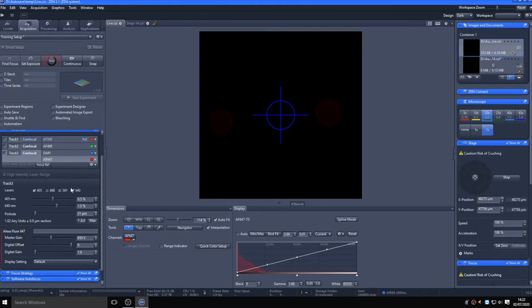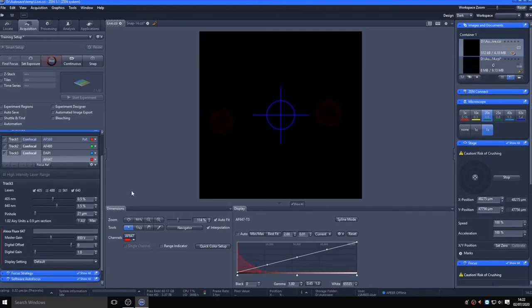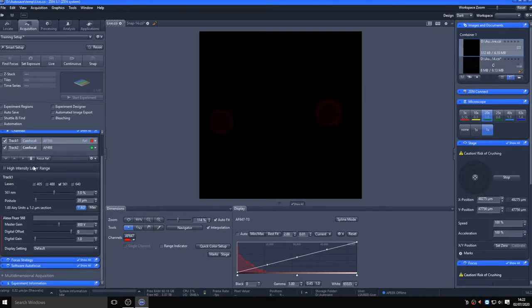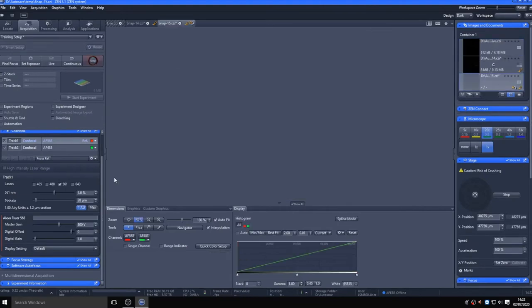For this training session, to keep imaging faster, I will remove both the DAPI and 647 channels and concentrate on the 488 and 568 channels. Taking a quick snap image, you can see that although the signal intensity is okay, the image is a little grainy. This stems mostly from shot noise on the photomultiplier tubes.